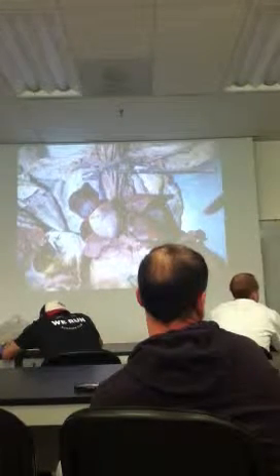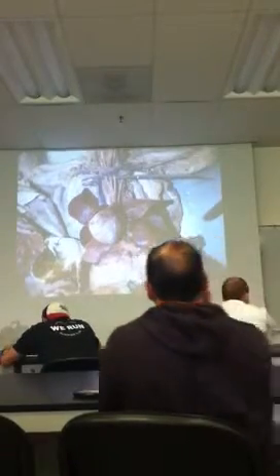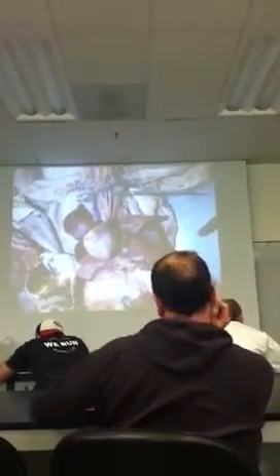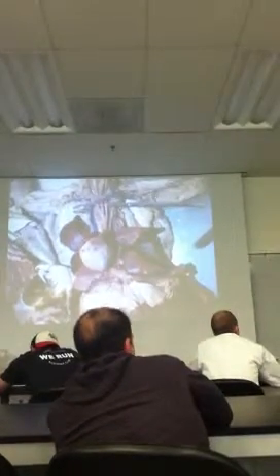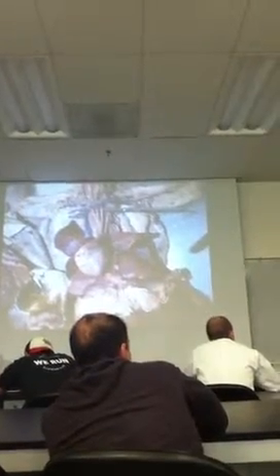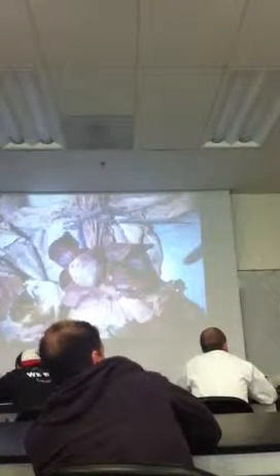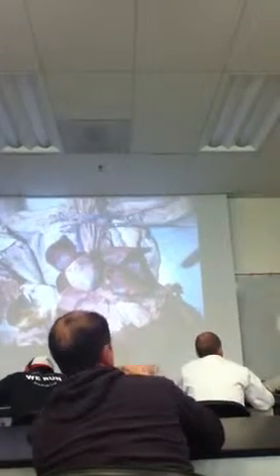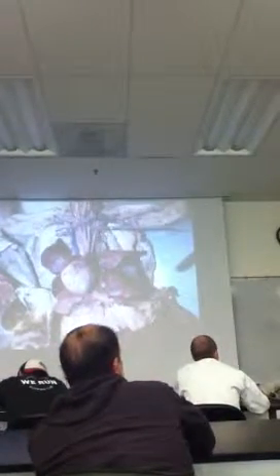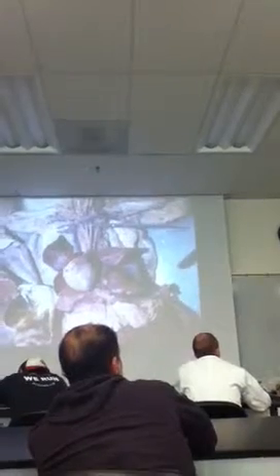But in your own cats, don't be so vigorous on dissecting. When I go over the abdomen, I will tell you not to put the other viscera away, because you will need them. Digestive system for the week after break, then after that we need urinary system. You need to study all these parts. So don't sacrifice anything for just blood vessels. You need to keep everything.